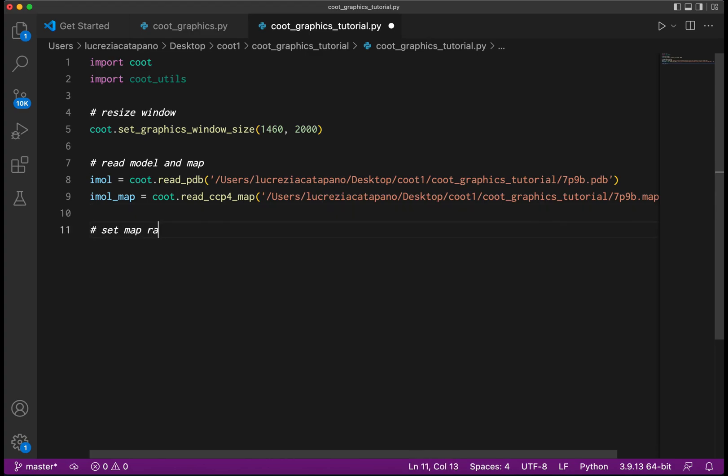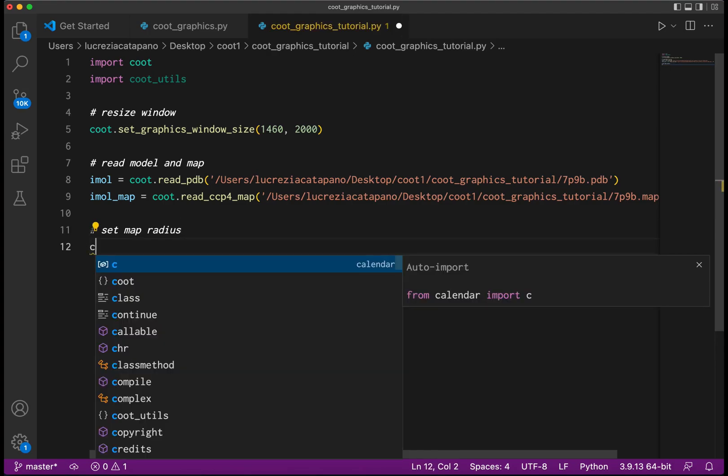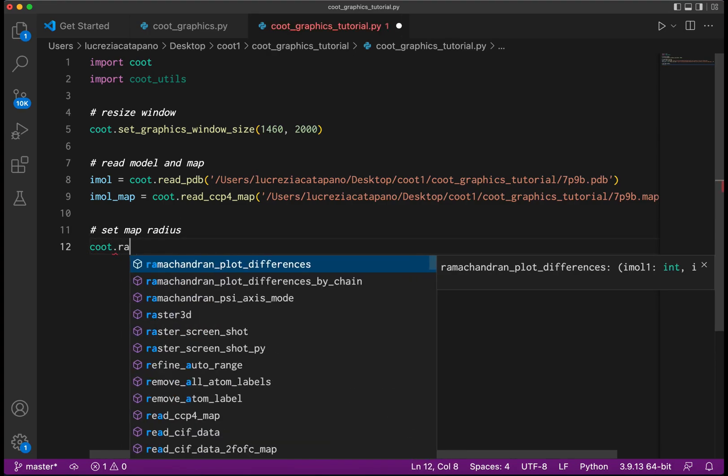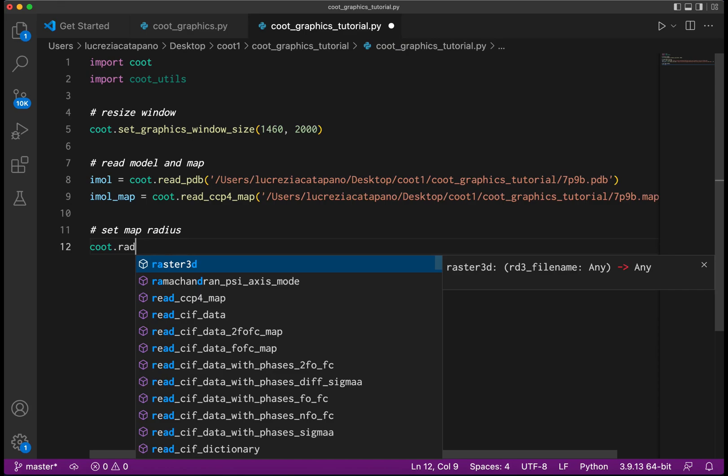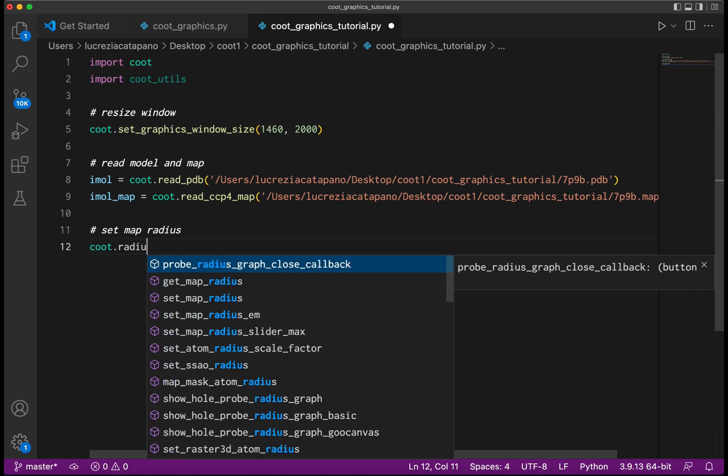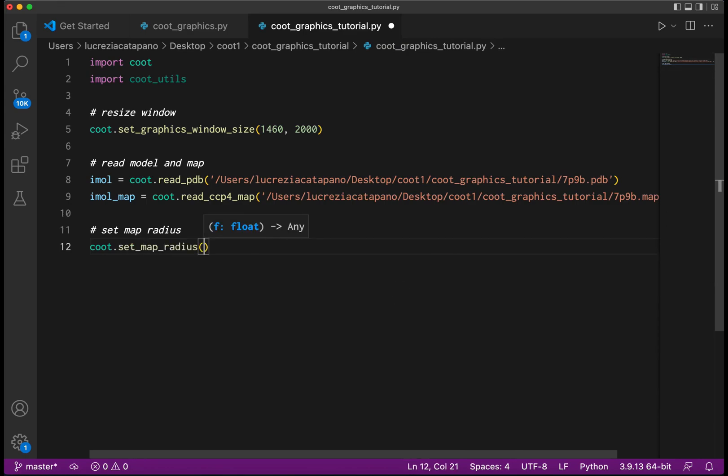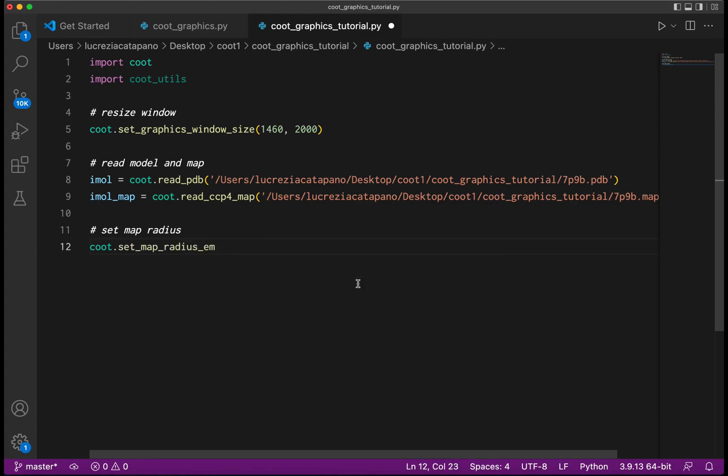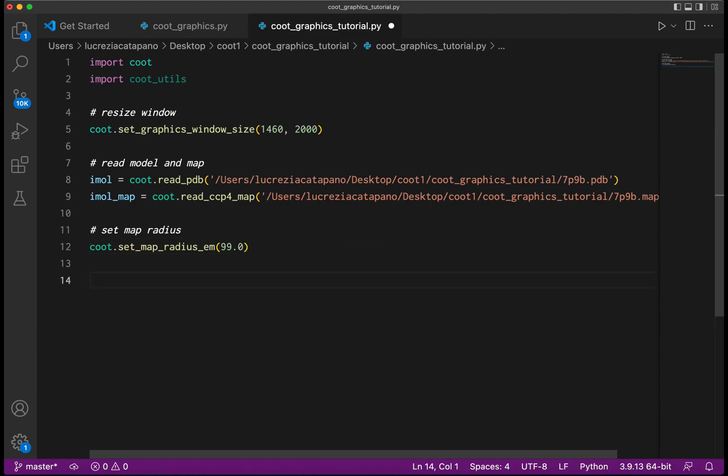Qt's default map radius is not quite big enough for this molecule, so we are going to increase it. We do that by using the function map_radius_em - 99 angstrom will be more than enough to do the job.